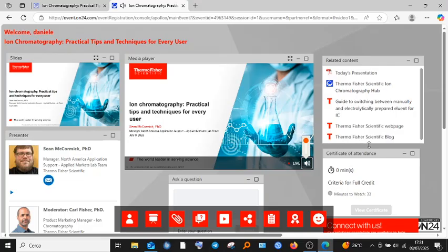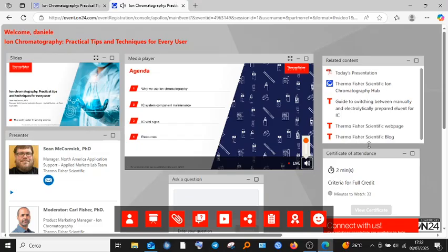Thank you, Carl. Good day, everyone. Thank you for joining me to talk about ion chromatography and some practical tips and techniques for the everyday user. In today's presentation, we will discuss a few different topics, starting with a short introduction to ion chromatography. We'll then move on to talking about ion chromatography system components and their basic maintenance and operation. When we finish that, we'll move on to discussing system vitals and how they can be used to monitor your system's performance. Finally, we'll wrap up with a discussion of some of the additional resources that Thermo Scientific has to offer when it comes to ion chromatography.